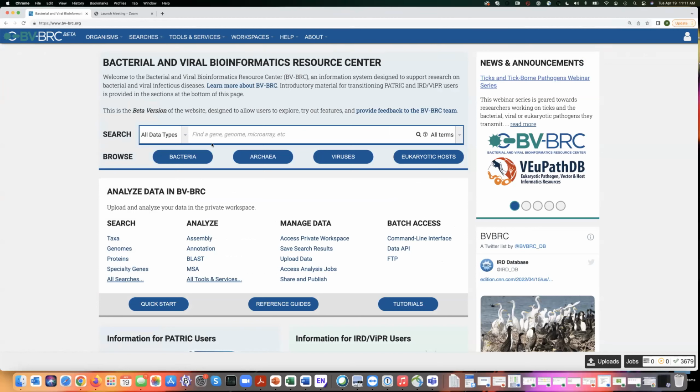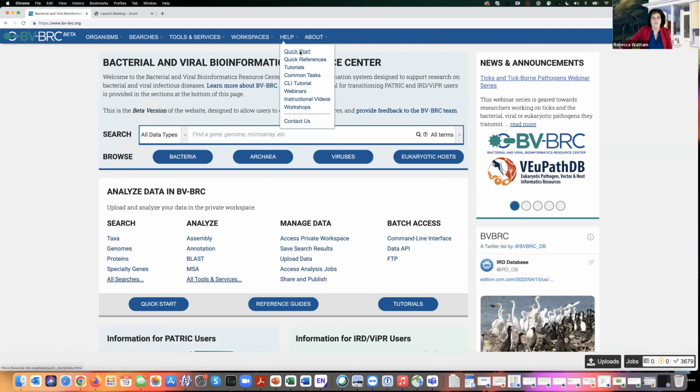Okay. So this is the home screen for the Bacterial and Viral Bioinformatics Resource Center. Now we have tons of information about this. We've given tutorials, webinars, instructional videos. I can't go through everything today, but I want you to know that this is all here under the help tab for you.